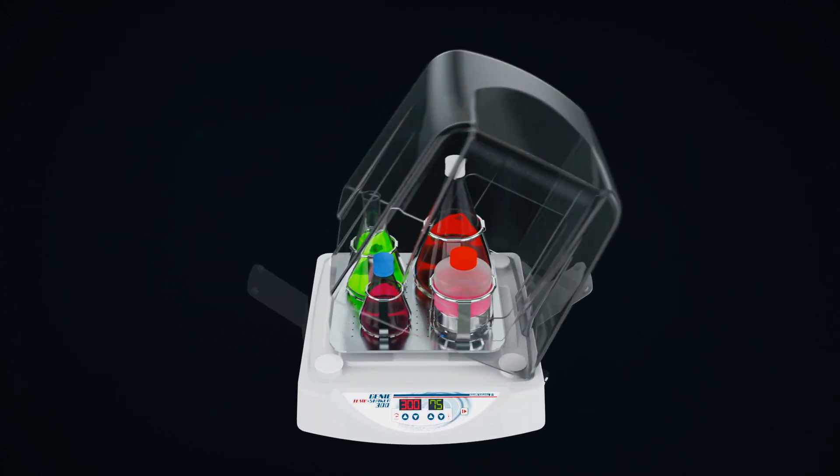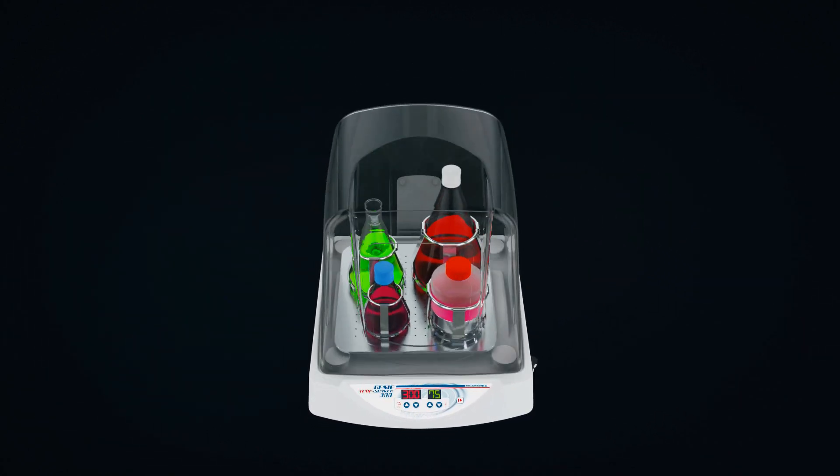Tilt the dome left, right, backwards or simply remove it.